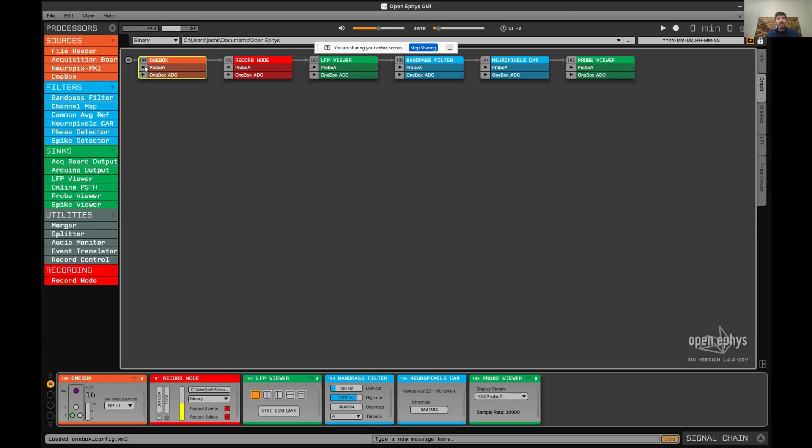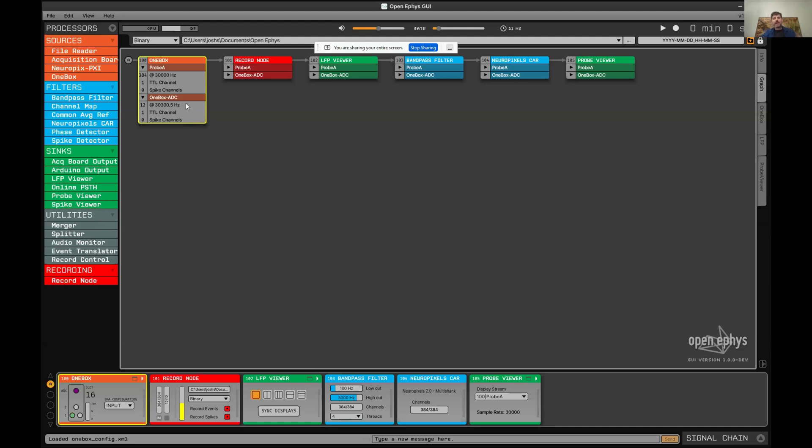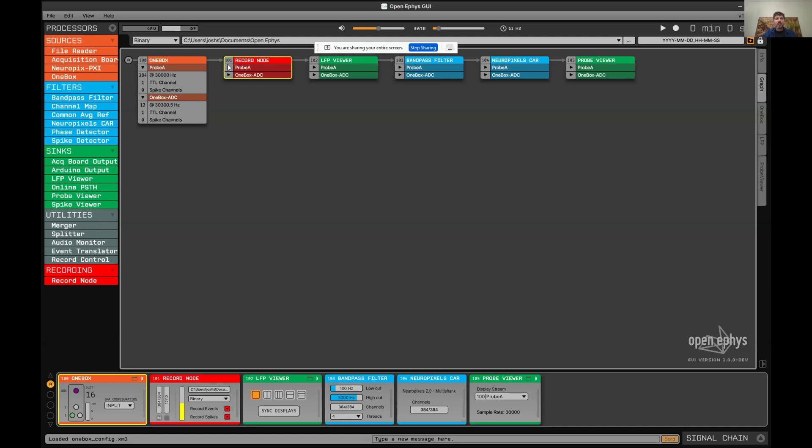For each plugin, you can see the data streams that are available. In OpenEFIS, a data stream is any group of channels that are sampled synchronously. For example, this OneBox has one probe connected to it with 384 channels at 30 kilohertz. All the samples in this stream are guaranteed to be synchronized, but they're not guaranteed to be synchronized with other streams that are recorded in parallel, for example, the ADCs on this OneBox of which there are 12. I'll talk about synchronization in a minute.